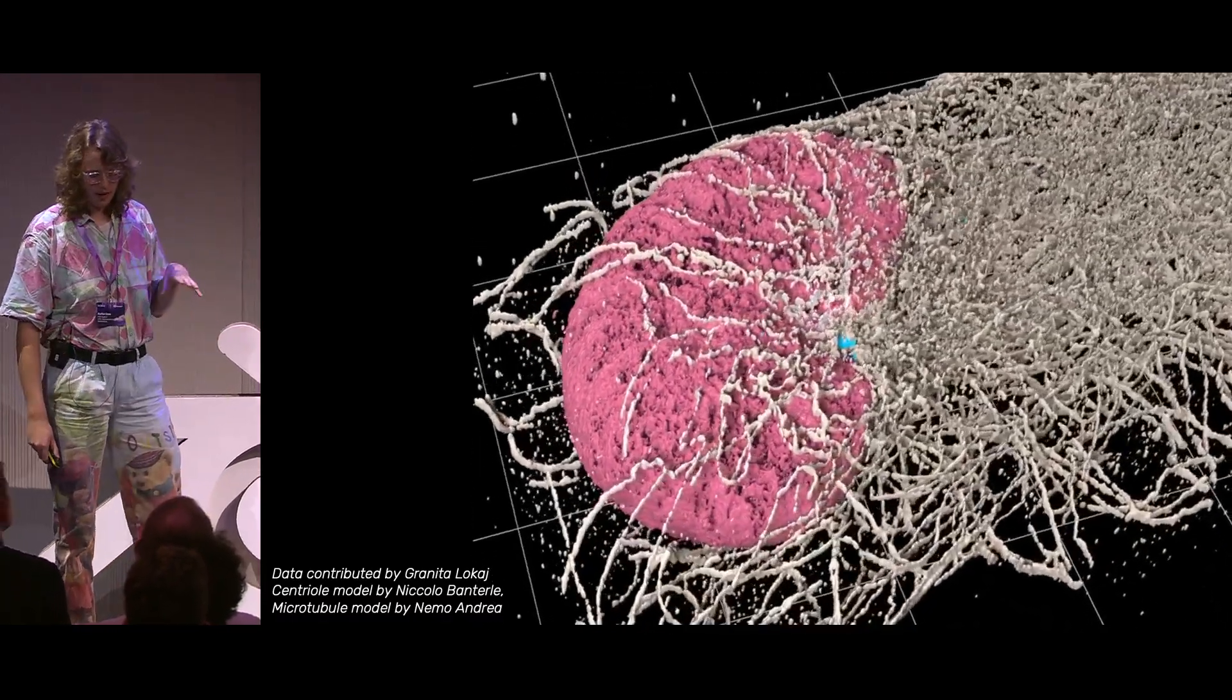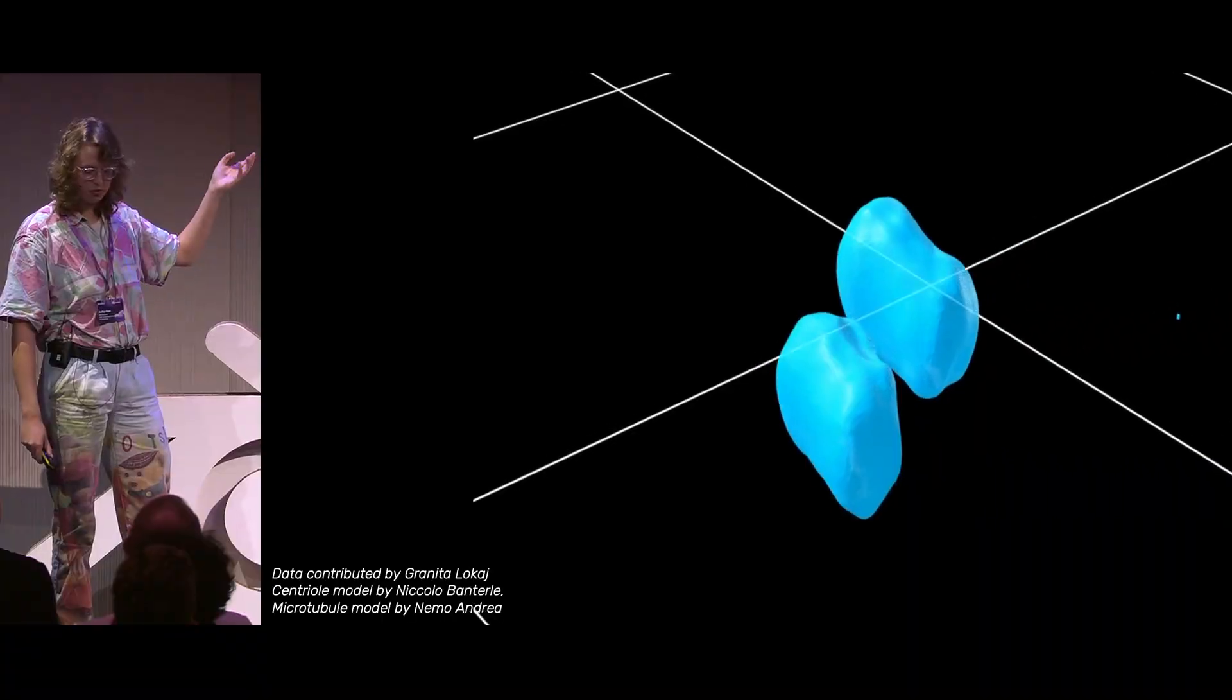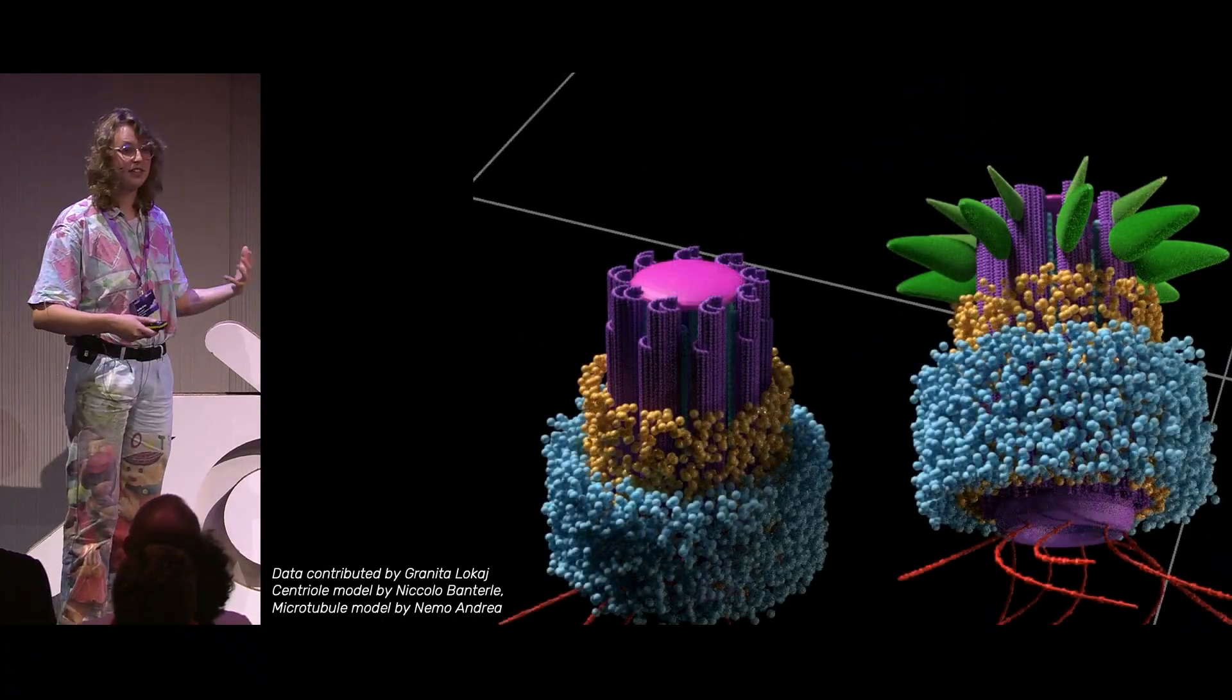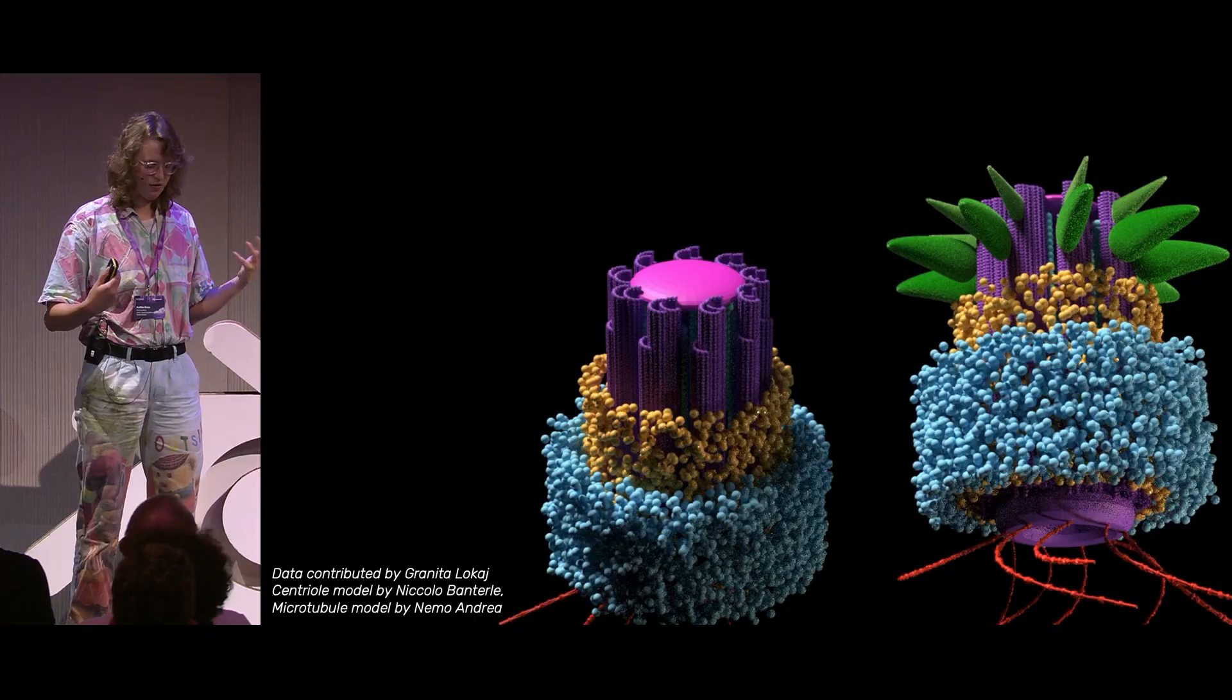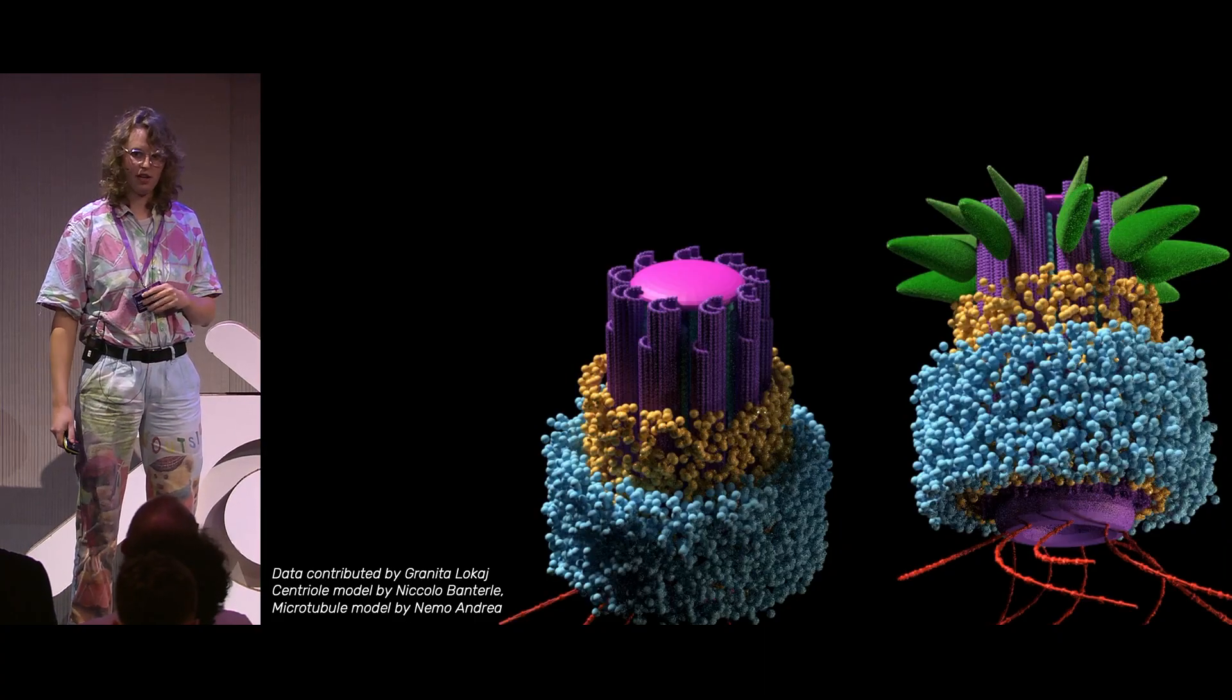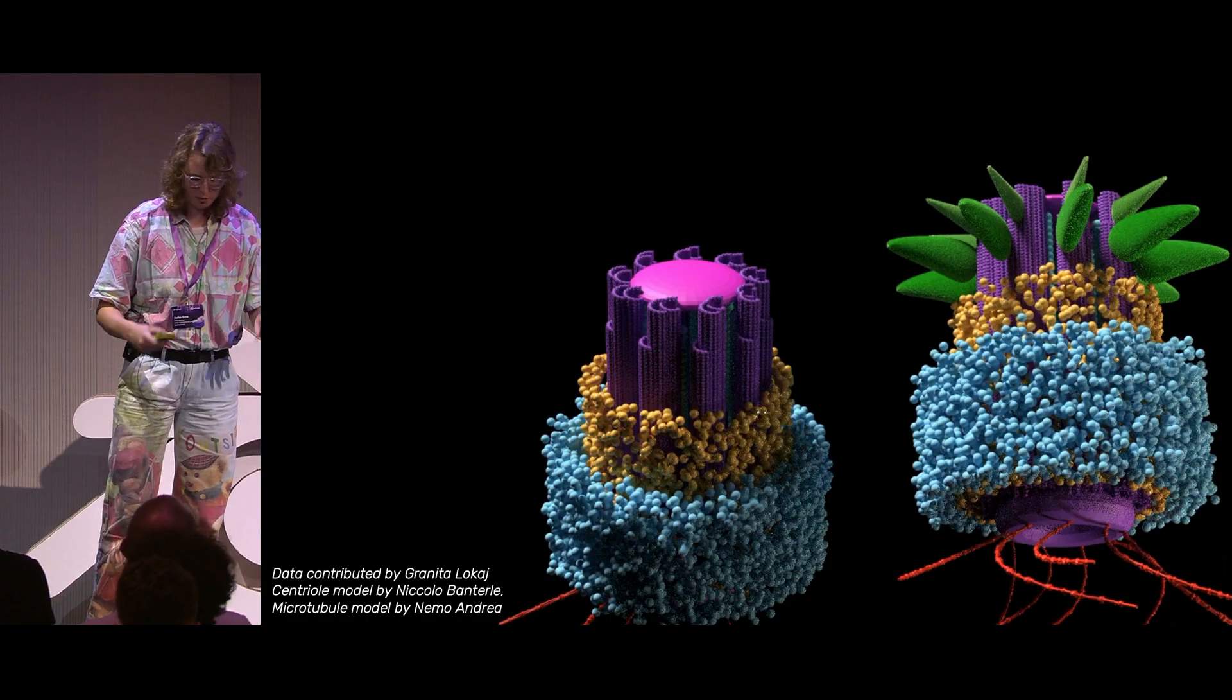So this is actually organized by two little factors that were also imaged here. And so we can zoom in, and we can zoom into these two factors and replace them with a procedural geometry nodes model of how we know they actually look. And this is really the power, one of the things that Blender can do for microscopy data that is not really beatable by almost any other visualizer is getting our models and our data to coexist in this same space.